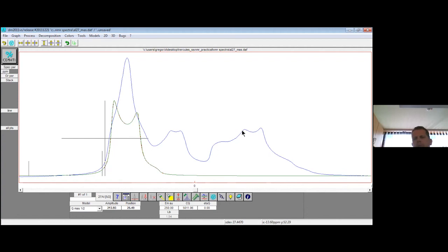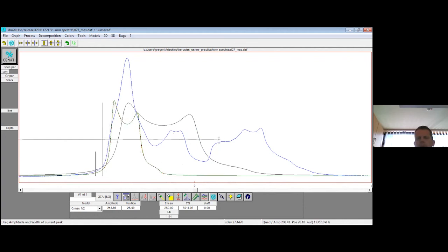I mean, it could resemble such part, but not this one. But if you know the theory and the background of quadrupolar interaction, you know that what we have been changing now is the magnitude of the quadrupolar coupling constant. So if I'm pushing this button, I'm changing the position and I'm changing the magnitude.